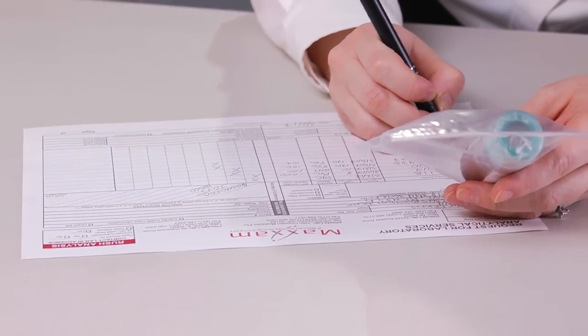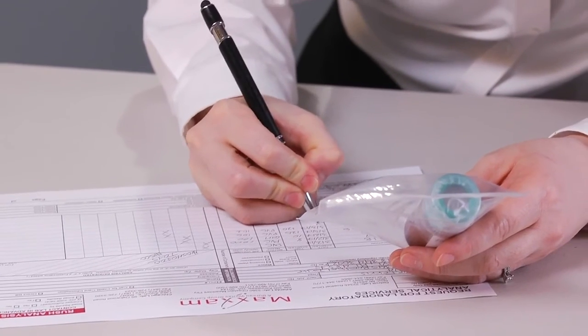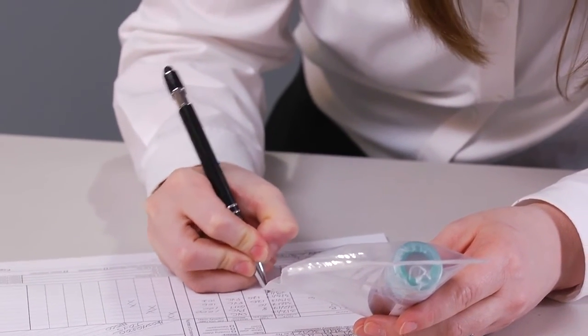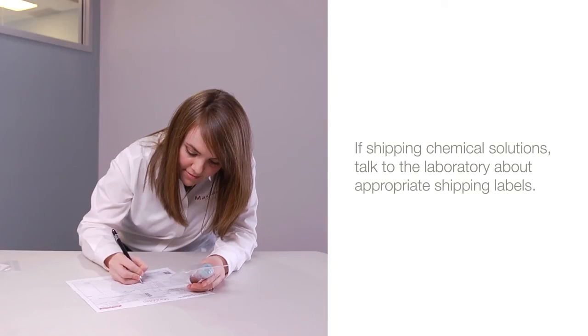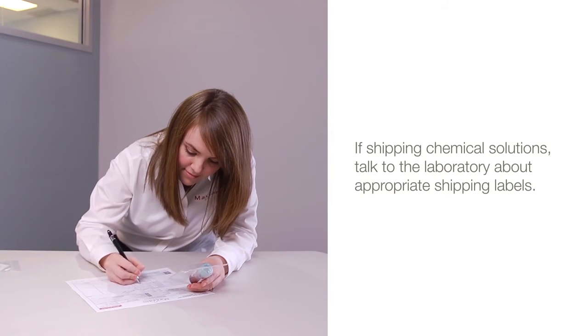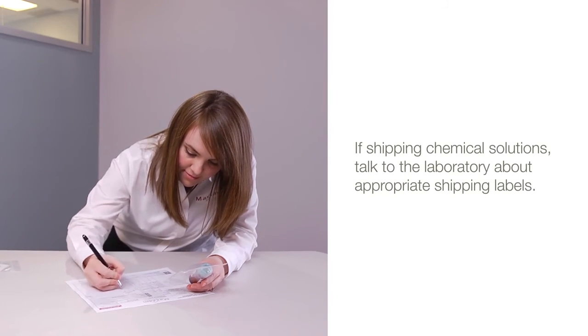Lastly, complete the laboratory request form, also called the chain of custody, and send the samples to the laboratory. If shipping chemical solutions, talk to the laboratory about appropriate shipping labels.